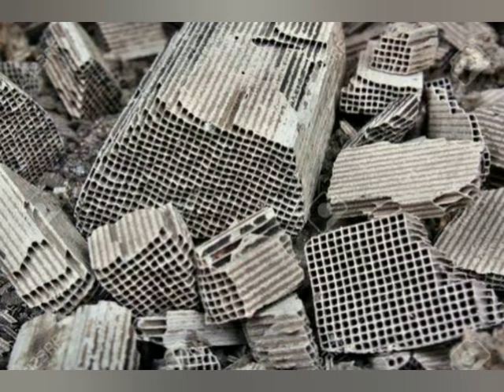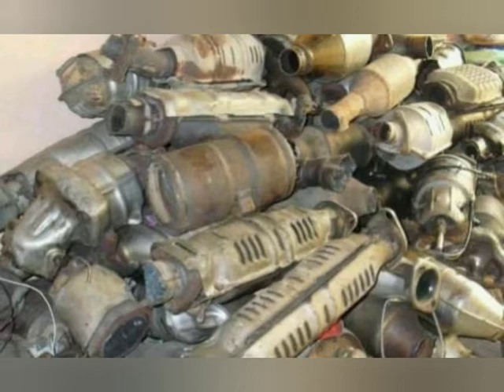Hello friend, today we are going to learn how to extract platinum from scrap in mini catalytic converters. Platinum is used as a catalyst, and after complete use it can be thrown away as scrap. Here you will have a scope to extract the platinum from that scrap.